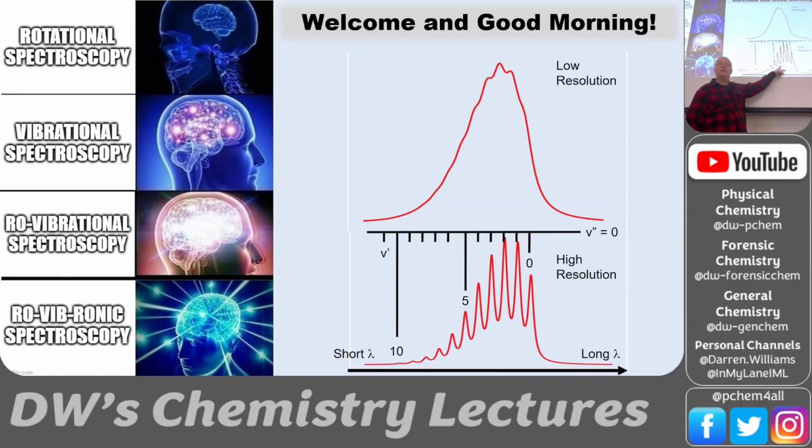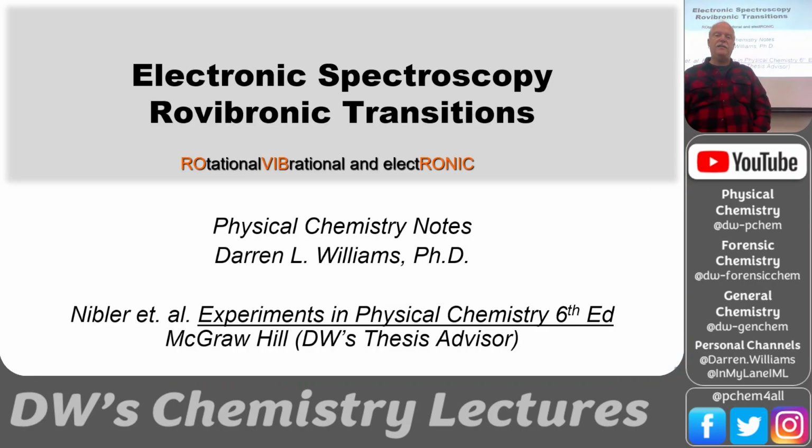And that's what we're going to assign in iodine. We're going to see those vibrational levels, assign the vibrational quantum number to those, and then pull out a lot of the spectroscopic constants for the iodine molecule. So that's the last full lab of the semester.